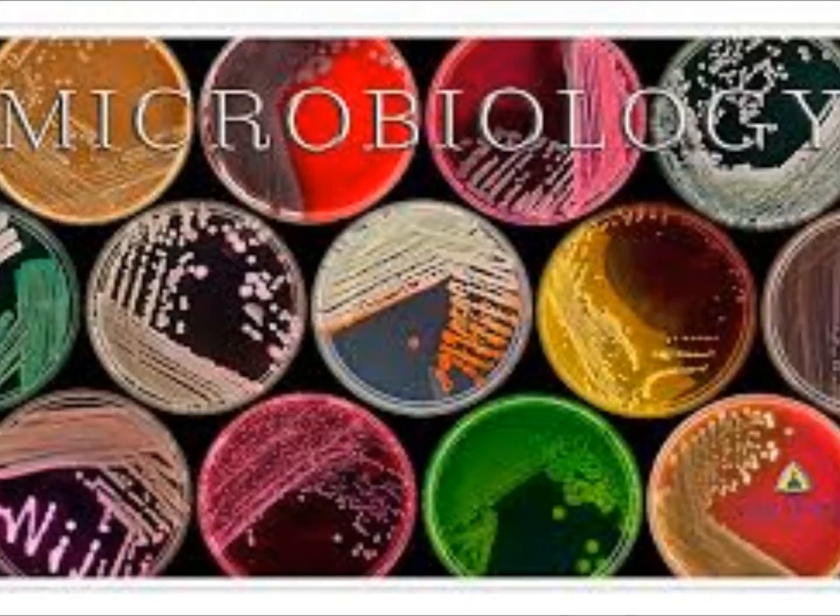So I'm gonna set the glabrata next to you guys. And always in the blood plate, we pick up the kind to see if it's smooth. Oh, that's right, this one's smooth.